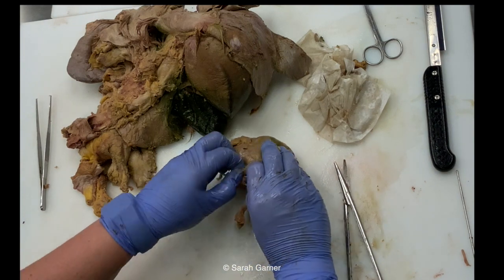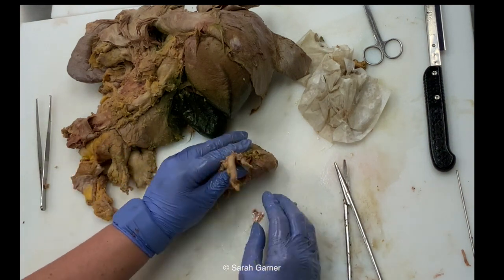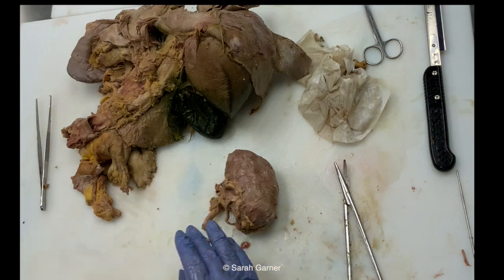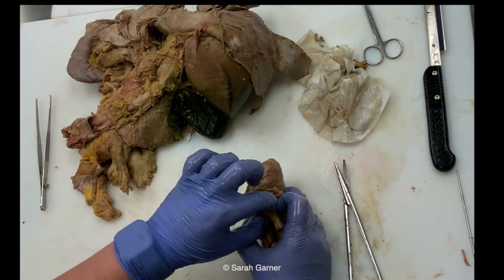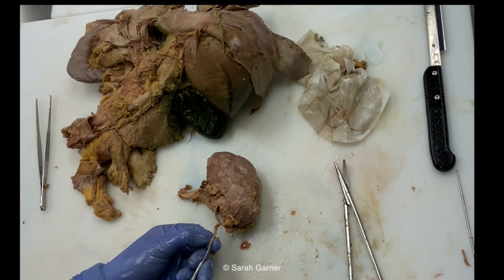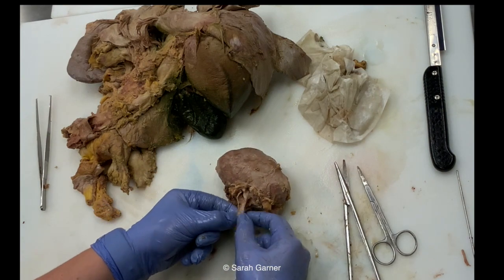And let's say there was a thrombus in a vessel or something like that. You'd want to take a photo, document it, and then take a section of it if you can, get a good section of it. So this is posterior, right? Because we're seeing the pelvis and the ureter. So our renal vein was most anterior, then renal artery. This would be our ureter and our renal pelvis. So we'll go ahead and open this one up to the level of the renal pelvis, just like we did the other one. So we inspect the inside of the ureter, nothing abnormal.